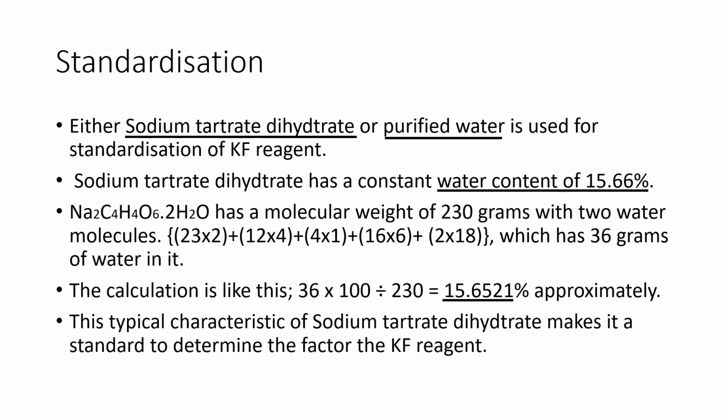This typical characteristic of sodium tartrate dihydrate makes it a standard to determine the factor of KF reagent. Sodium tartrate dihydrate has two water molecules firmly attached to the molecule. This specific characteristic is used for standardization of Karl Fischer reagent.